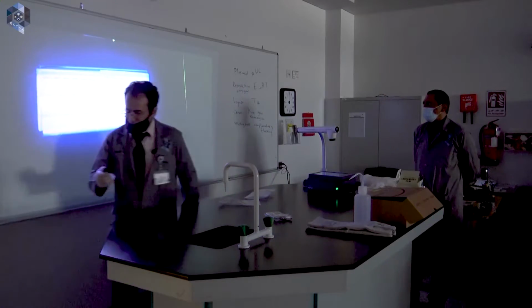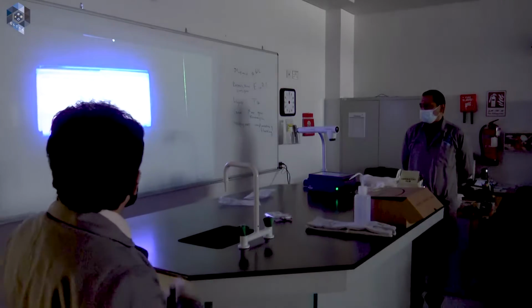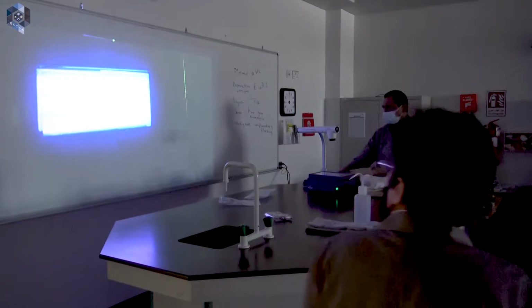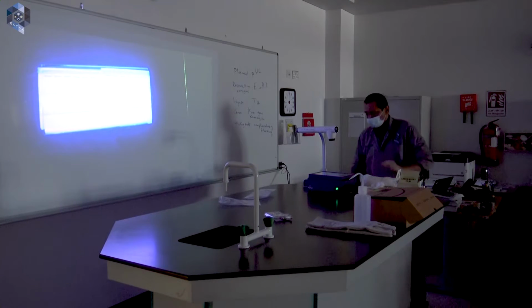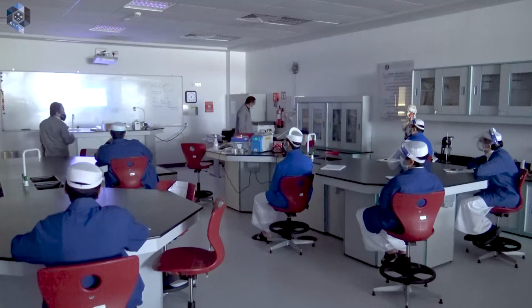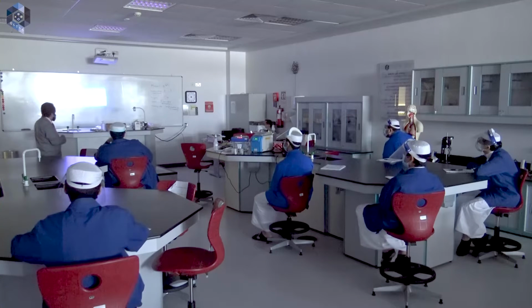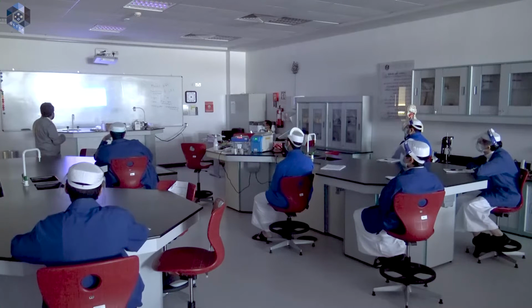It is much clearer in the gel itself than it is here. Now, look at these different lanes here. In the first lane, how many bands can you see? One. In the second lane, in the third, in the fourth, two bands you can see, right? The last one, this is the ladder.